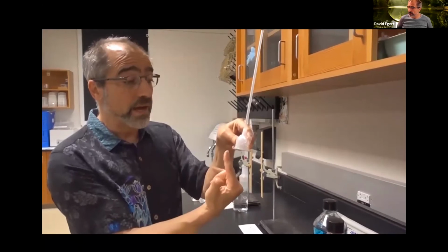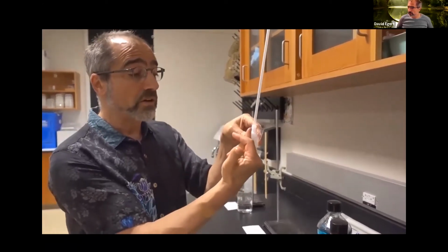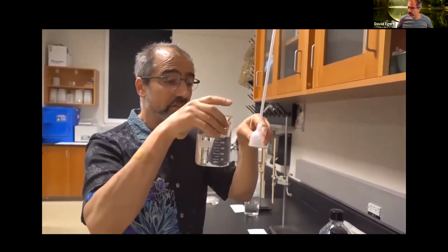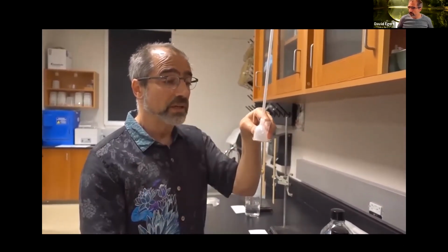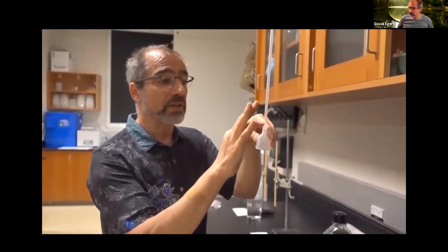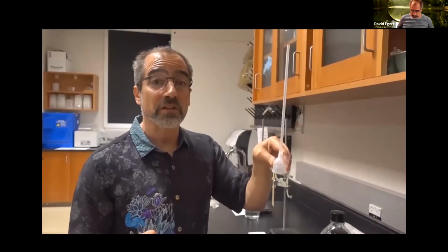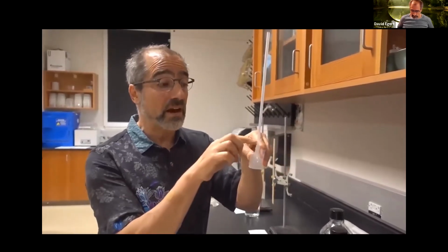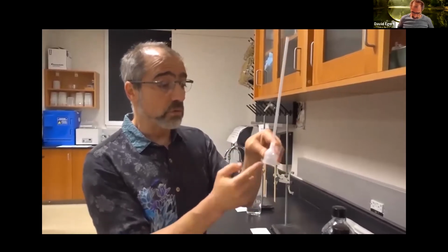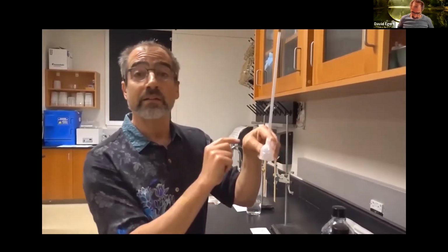And that's going to drive osmosis, movement of water across the membrane from the beaker into this little thistle tube, which is going to start going up and up and up. So we're going to be able to actually monitor the progression of the osmosis by seeing how far up the tube this sugar water goes as more and more water comes in.